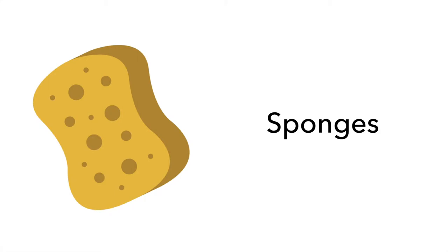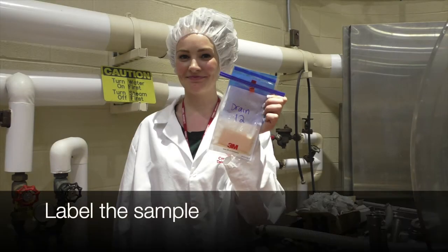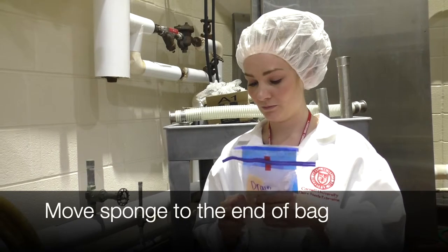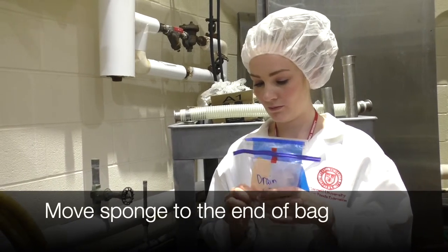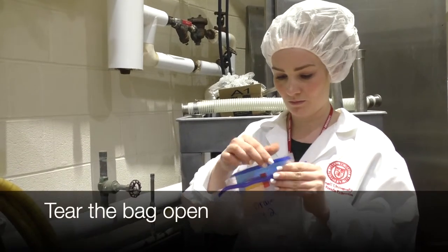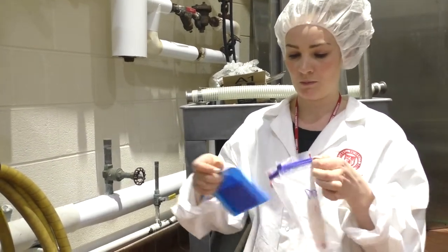Sponges are useful for sampling larger surface areas. We prefer loose sponges over sponge sticks for areas where a sponge stick won't fit but a folded sponge will. Label the sample with a permanent marker for identification. Move the sponge to the end of the bag. Tear the bag open. Note, do not set the opened bag down.